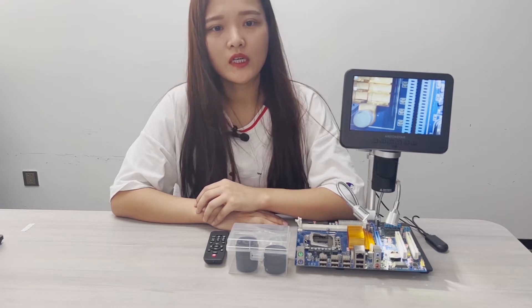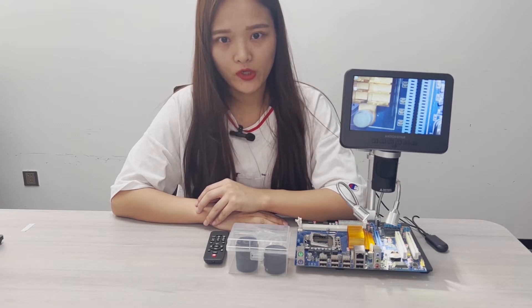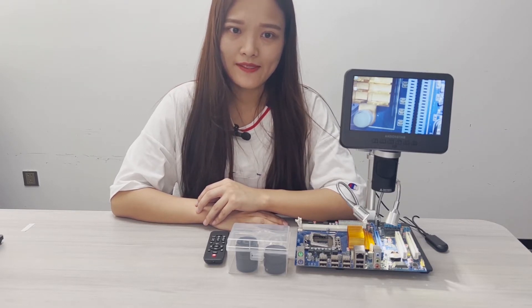Back to our topic today, the 246S. This device is a little more complicated than our previous models, so I'm gonna break it down to three parts: monitor, lens, and bracket.